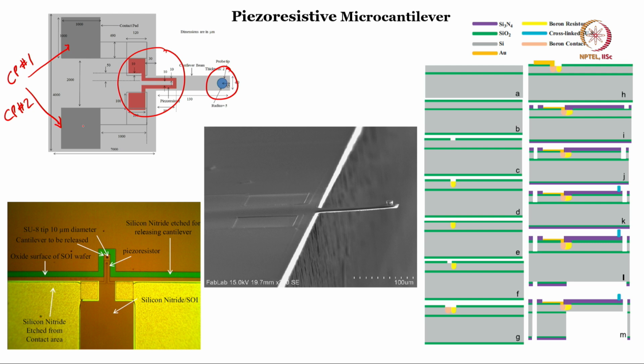These are gold. Somewhere you see these contact pads, this one and this one are here, and the big one goes all the way out. So here what you see in this SEM image, these two are this one and 2.